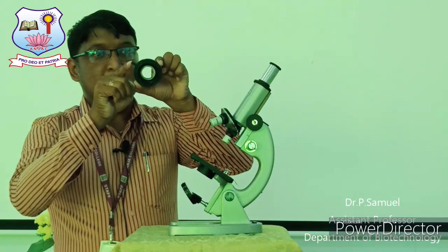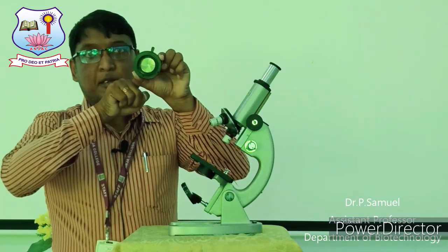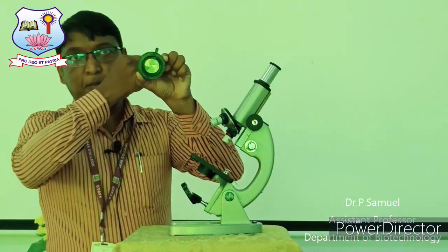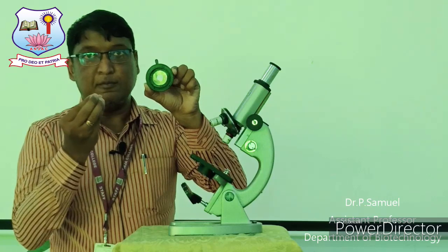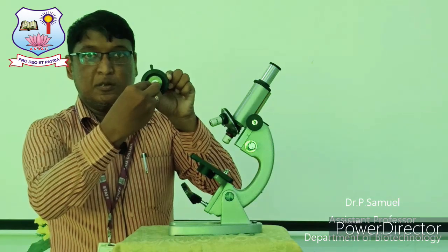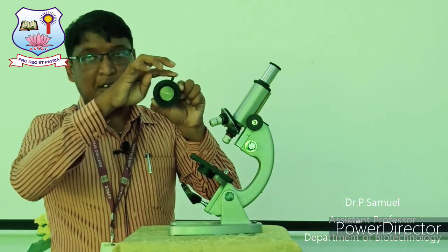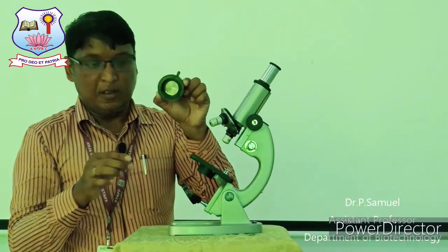And the thing which is inside the diaphragm is called the aperture. See, the hole is very small in nature, so only a low amount of light enters into the pathway. Once you adjust this, the size of the diaphragm increases so that more light passes through the diaphragm and reaches your eyepiece lens. So this is to control the amount of light entering into the microscope. This is a very important portion for every microscope.